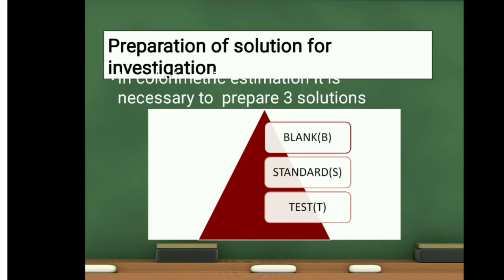Preparation of solution for investigation. In colorimetric estimation, it is necessary to prepare three solutions: blank, standard, and test.